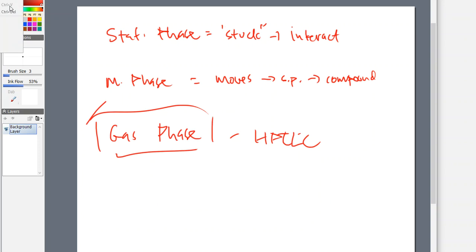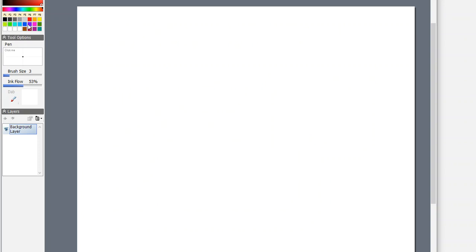All right. Before I let you go with this video, though, we need to talk about some things that are maybe problematic with HPTLC. First off, TLC was used because it was very easy, right? It is super cheap and it was super easy back in the day to get this. All I needed was a little flat piece of glass, some silica, and we'll talk about that as well, and some binder that makes it stick. And then I just apply my samples and drop it into a container. So this was very easy to use. It was very easy to train other people on what to do. So this was the great thing with TLC, and it's still the great thing with TLC today.